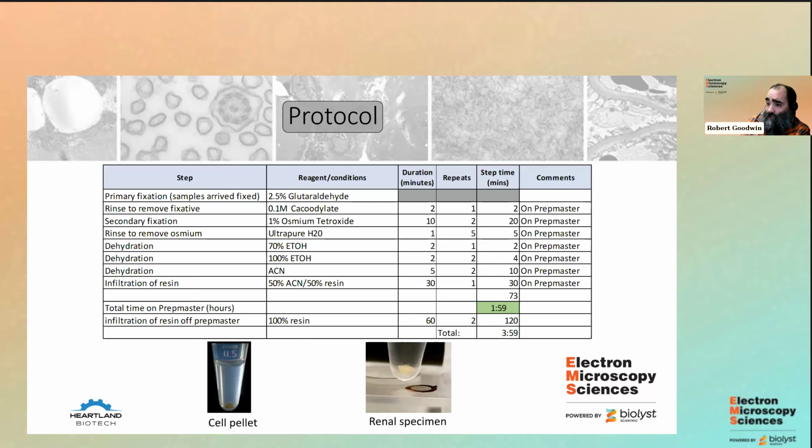So start to finish on one column for me is an hour and 59 minutes. Now, when you add additional columns, it'll add just a couple minutes to each one, just for the time it takes to transfer between the different ones.